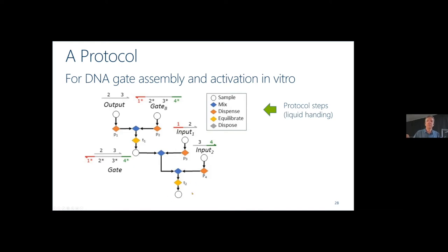So these are all liquid handling operations, and the operations are typically: you start from a sample, from a test tube with some known quantities. You can mix them, you can split them. The dispense means split them in two or more parts. You can let them rest, equilibrate, so let the system evolve by its own rules. And then if you want, you can throw away some of the parts you don't care about. So a protocol is a sequence of steps using these instructions that hopefully achieve some result that you're hoping for in your experiment.